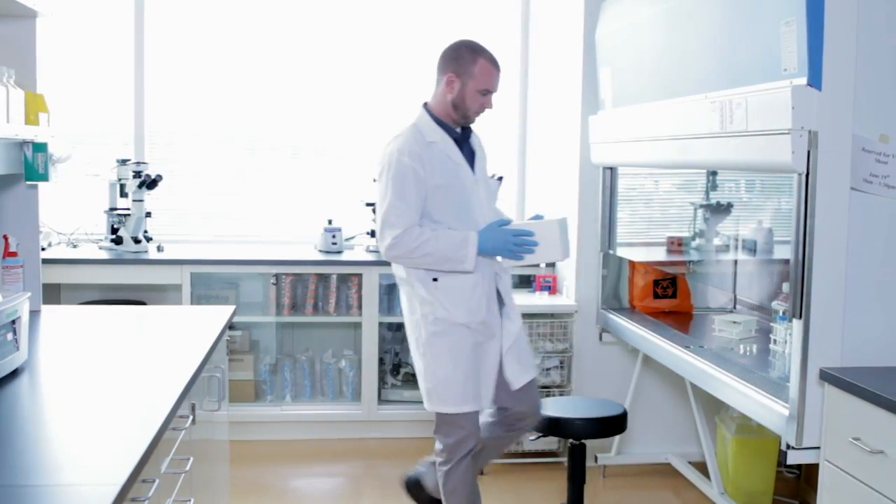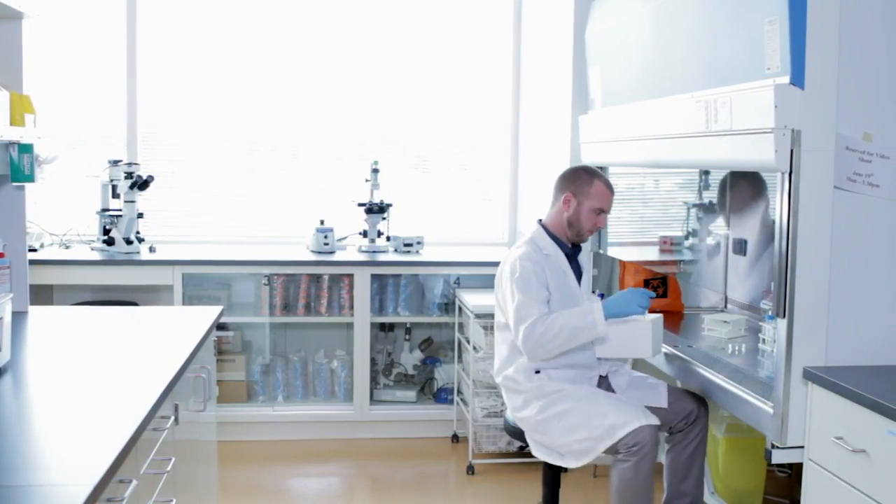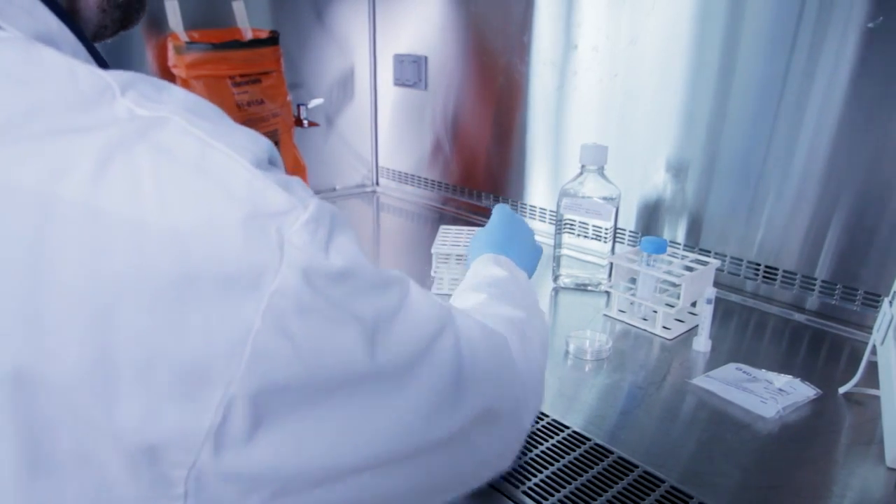One of the most important factors in successful cell isolations happens before you even start your separation. Preparing a true single cell suspension of your starting sample will optimize your cell separations by avoiding additional cell loss and enabling maximum labeling of the target cells.